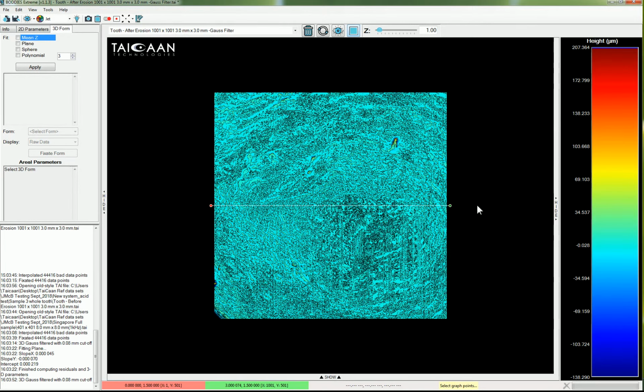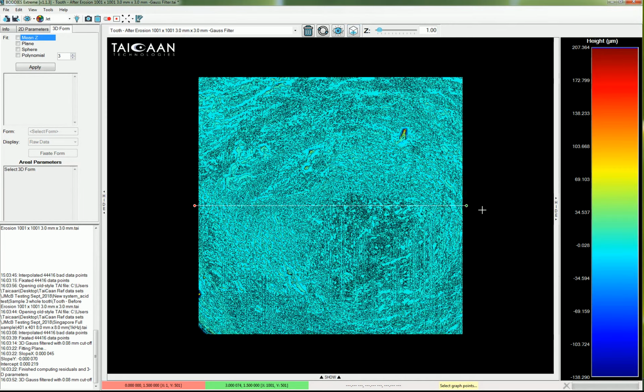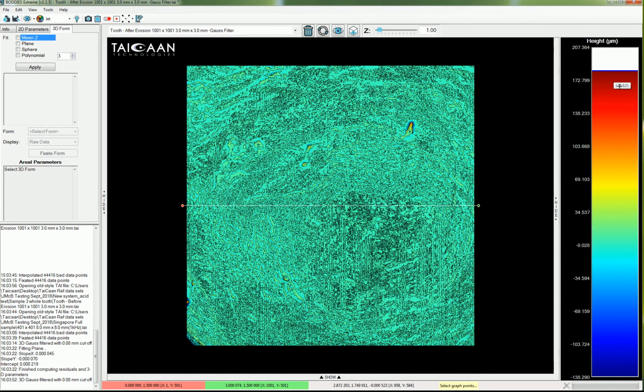Just make it bigger. With this coloration, with the color scale as shown, as before, this has now nominally been leveled. And actually you can see straight away from this cross-section the effect this has had, where the central region here has been smoothed quite dramatically by the presence of the citric acid. Well, we're doing this in 3D, so let's hide that. As we did before, let's adjust the color scale, and let's see what we get just by adjusting this.